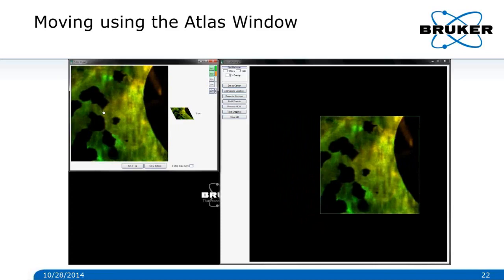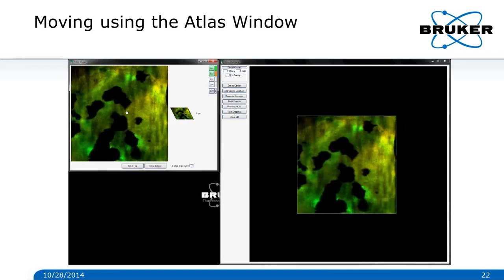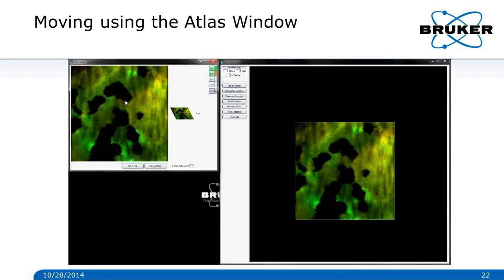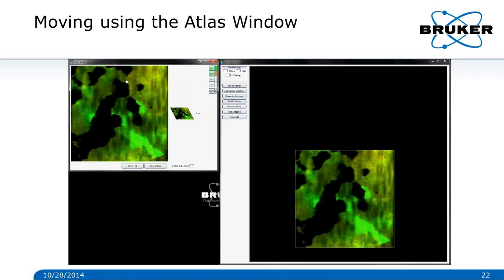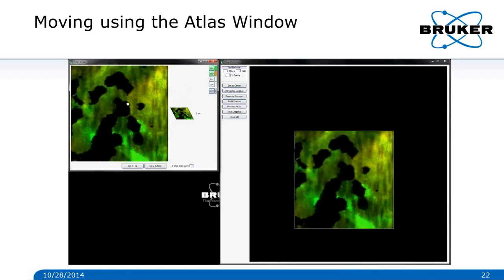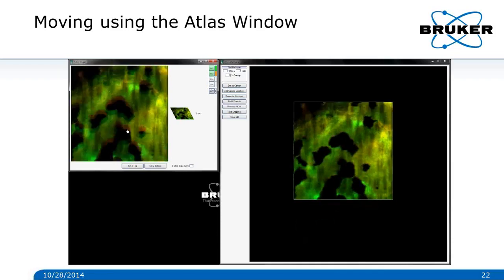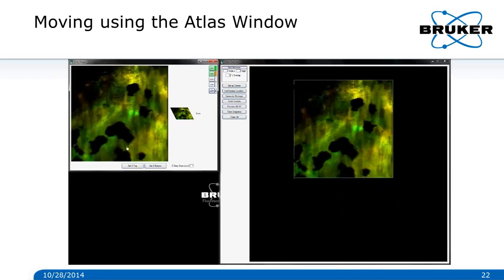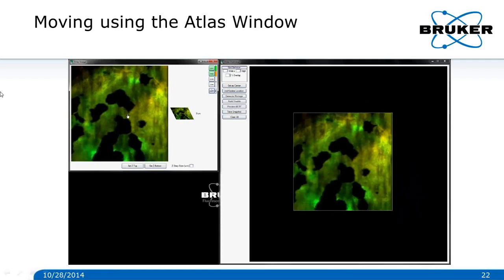And when you find a place that's of interest, you can just click on add or update location, and it will freeze a thumbnail in that particular location. And then as you continue to navigate around to find other locations, that tile will remain in place so that you can see the relationship between where the current live image is and other places where you've already stored a location.